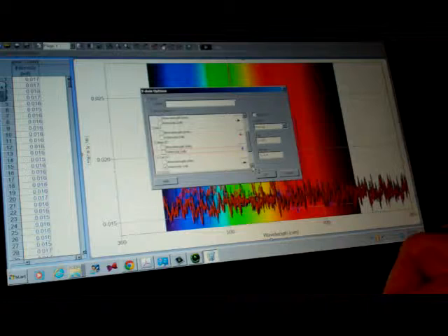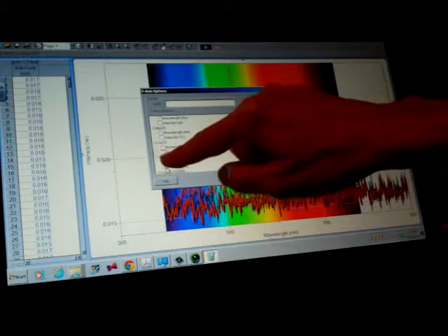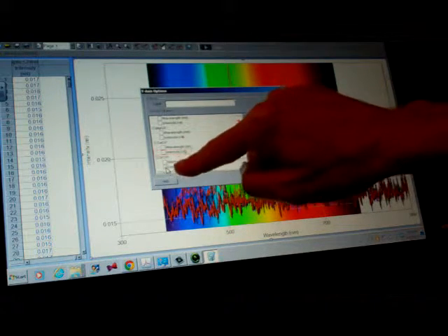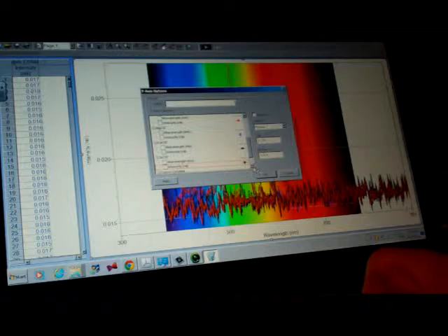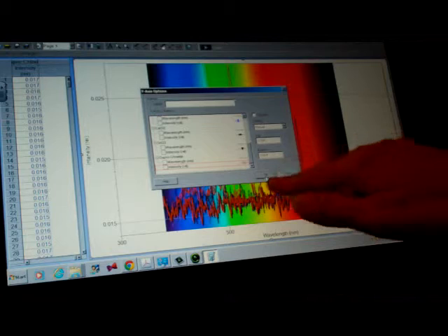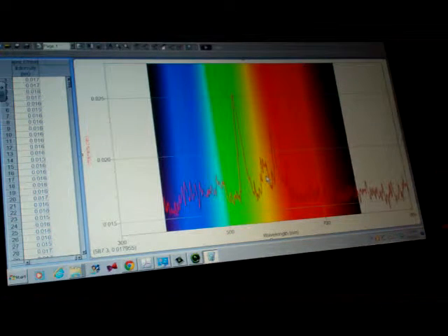What I mean by clicking off is, I am scrolling down, for example, I'm up to strontium chloride under intensity. Just click the check mark next to intensity. When I click OK now, I only have the one peak.